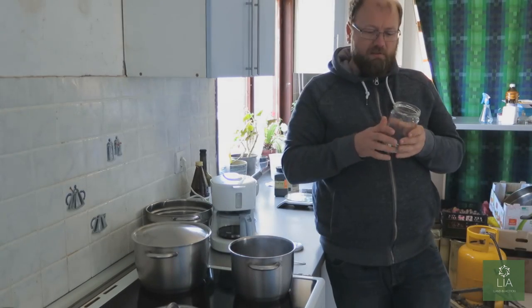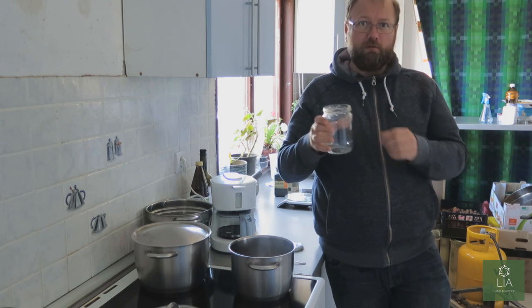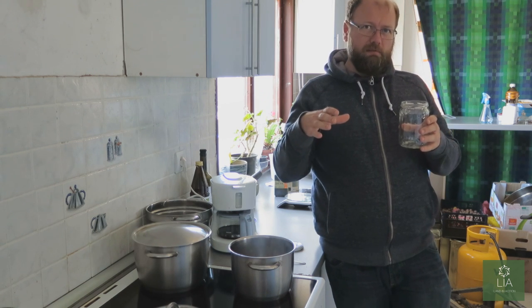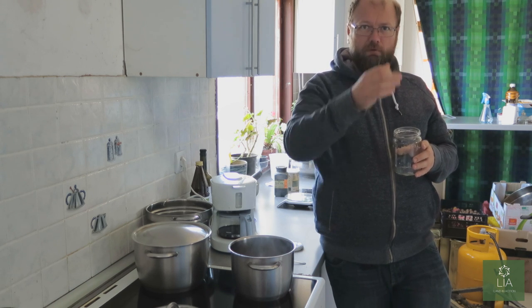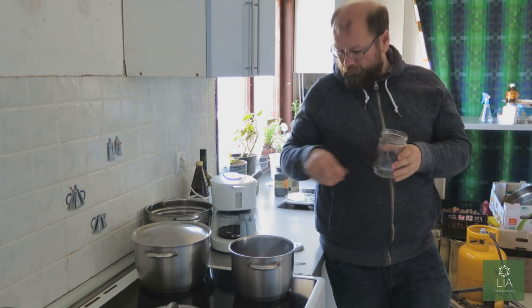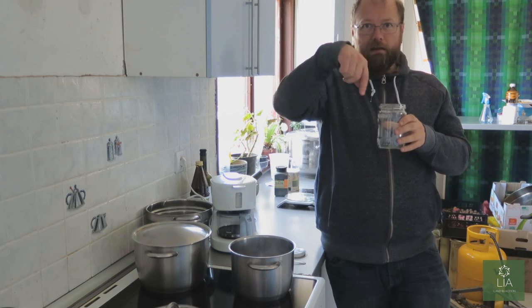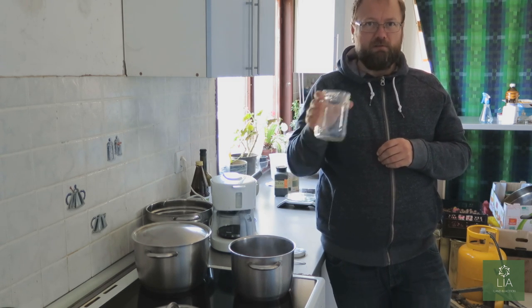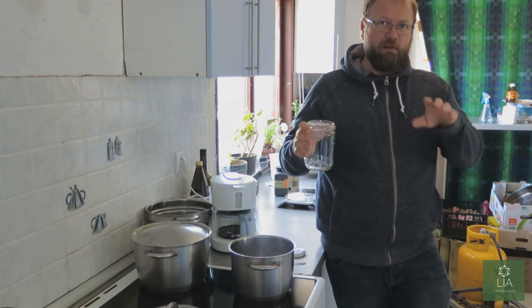In the ideal world, you want a glass beaker that has a pouring funnel on that you can put into the pressure cooker. If you see in your lab, you see these curved beakers that have a funnel at the top. You could do the same thing. Get one of those, stuff the end with the filter material that we've been using, the polyester, and then wrap that in foil before you put it into the pressure cooker. For this purpose, we're just going to use a jar. It'll be a little bit messy in the next stage because we're going to pour that into the petri dishes, but we'll survive.